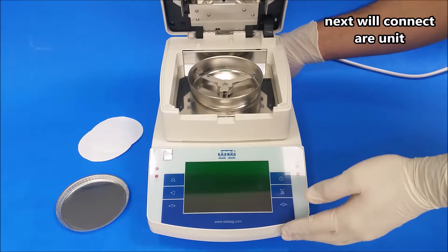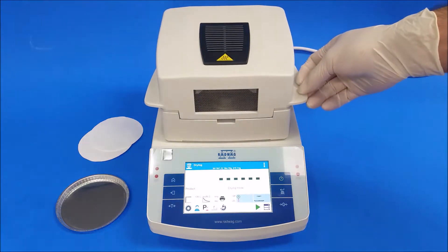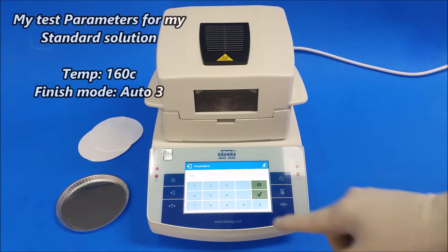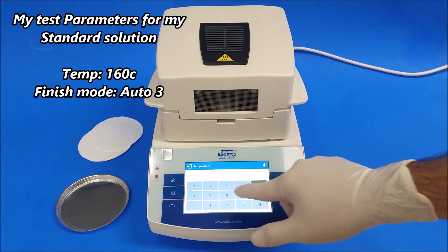Next, connect your unit and keep the hood closed. Now I'm going to change my test parameters from my standard settings — I'm going to run a liquid standard solution form that we have here.